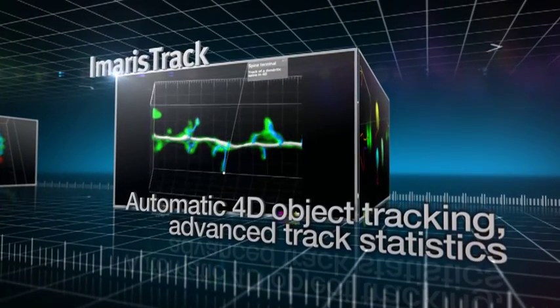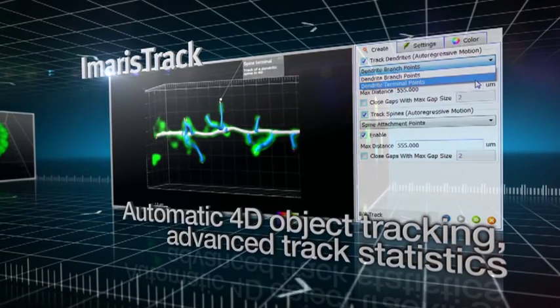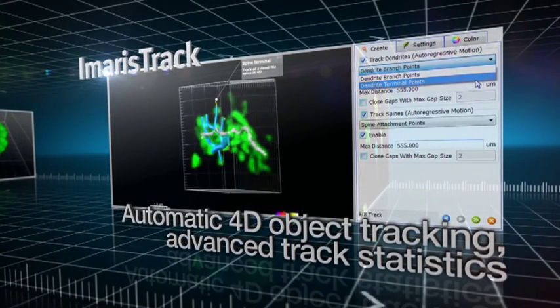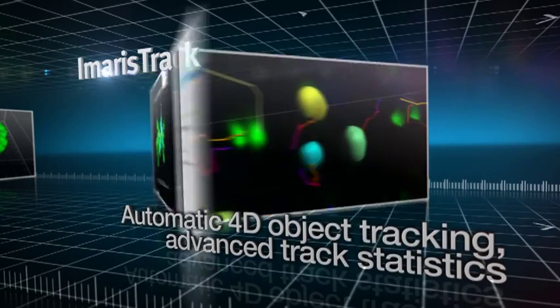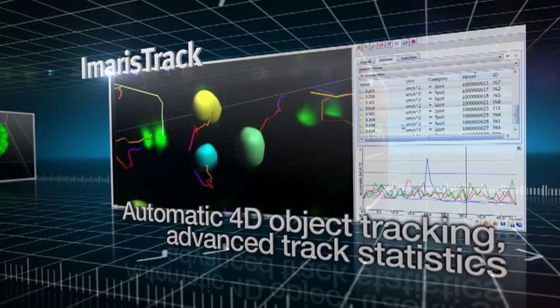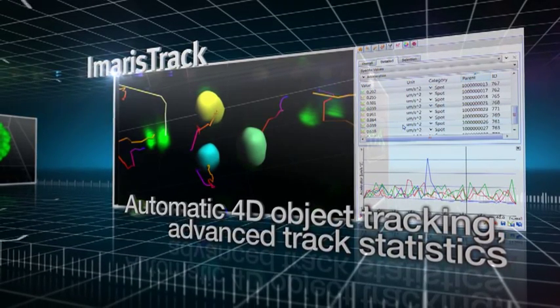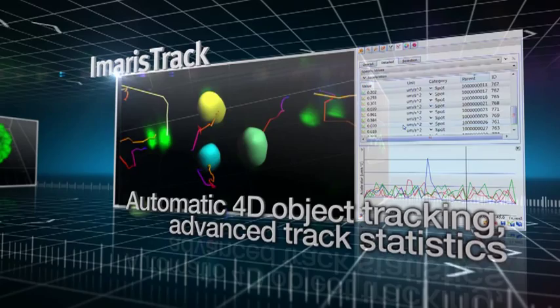Imaris Track is the cutting-edge scientific solution for 3D and 4D object tracking. Monitor, visualize and quantify rapid temporal changes in complex biological systems. Imaris Track lets you tackle challenging processes like dendritic spine modifications and intracellular traffic events.